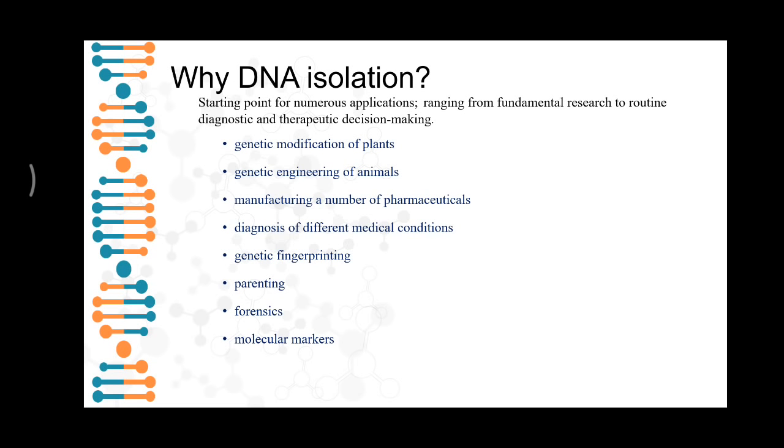Why do we need to isolate DNA? It is the starting point for numerous applications, ranging from fundamental research to routine diagnostic process and therapeutic decision making. In all the value of biological explorations, DNA plays a major role.